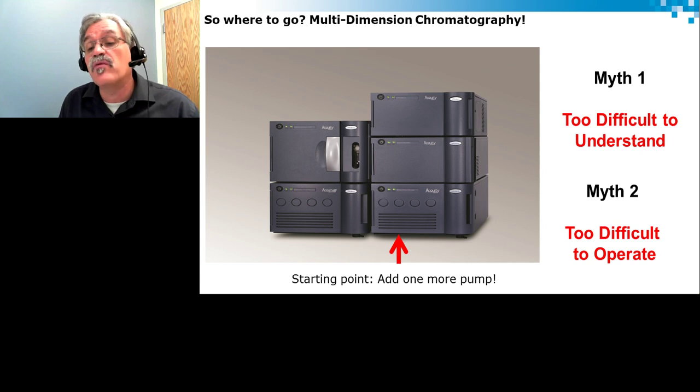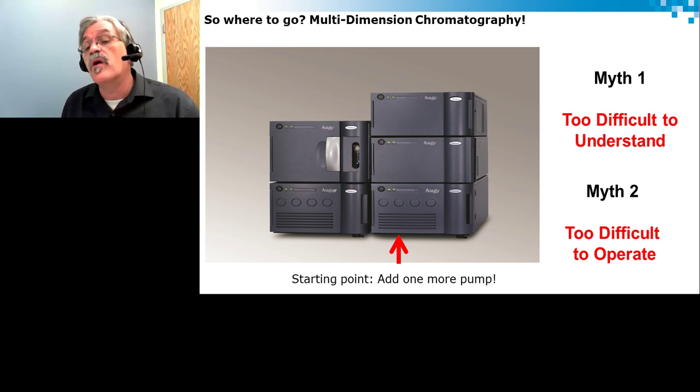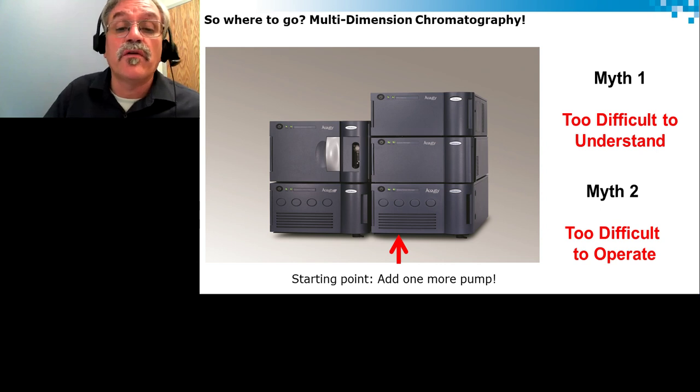The reputation at hand over here is when we go from a one-dimensional chromatography unit to a multi-D, there's two myths that one will see coming up more often. One is it will be too difficult to understand, meaning that I cannot utilize this one. And the second myth is because of that difficult to understand, it will be very difficult to operate, install, troubleshoot, and produce decent results. Well, this is actually what this presentation is all about. So let's go into the heart of the topic.